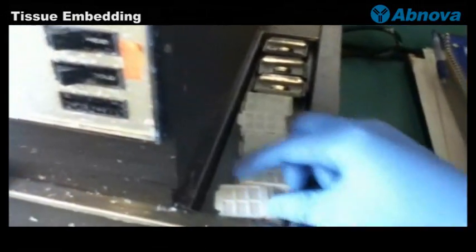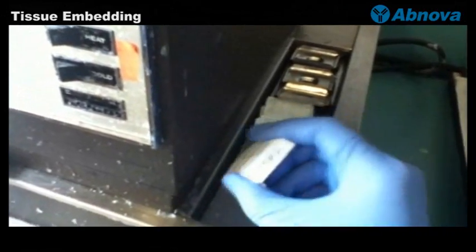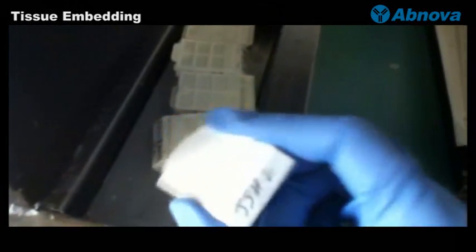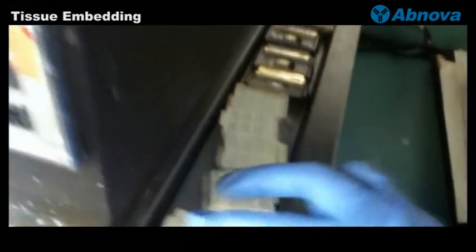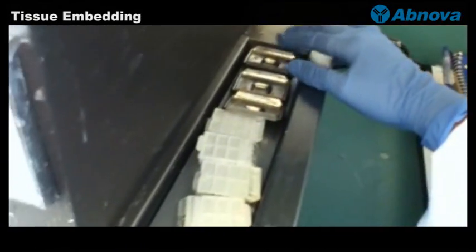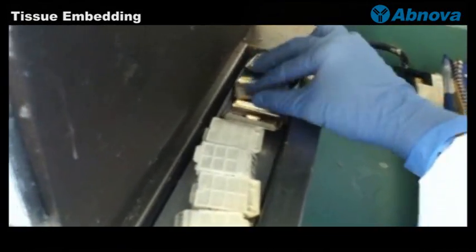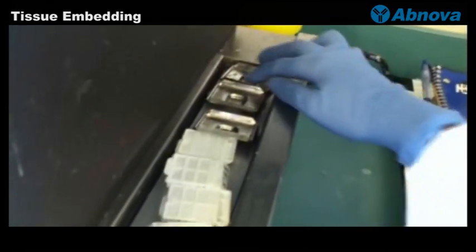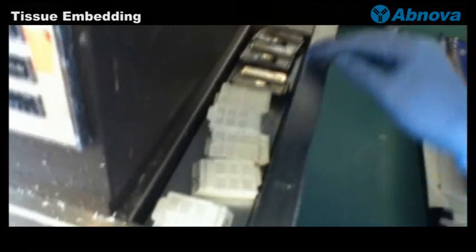We will put the bone chips cassette that has been labeled on the heat reservoir here that will keep them warm, so the paraffin will be nicely melted.